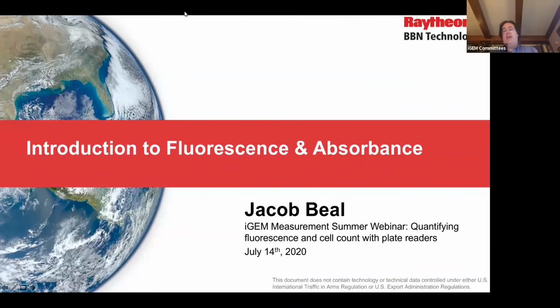So today is the first of a pair of sessions on fluorescence. Today, we're going to talk in general about fluorescence as a measurement and debugging tool, and then talk about using plate readers to measure fluorescence. Next week, we are going to focus on flow cytometry as a measurement mechanism for fluorescence.